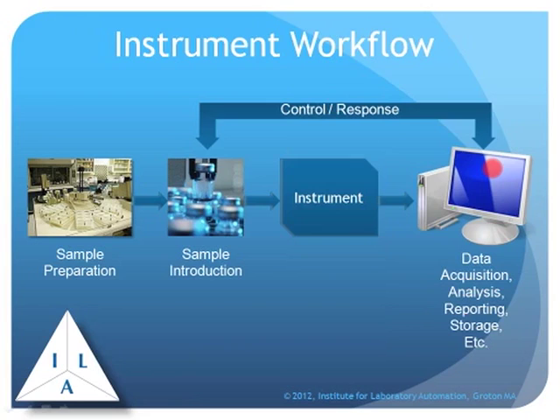Use chromatography again as an example. All the data for a given chromatogram is measured from the injection point. So the computer and the auto sampler have to agree on when that injection point is, otherwise the data is going to be erroneous. So in all the systems where we deal with this kind of workflow, we have to have coordination between the sample introduction and the data system so everybody's working with the same set of information, including perhaps reading barcodes to make sure we know what the sample is.